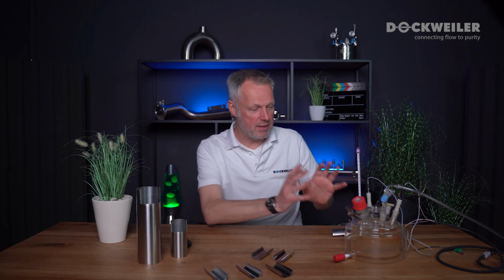In the last two videos, we have been talking about these samples, these specimens, where we identified carburization. And it was a more qualitative point of view. In this case, we would like to talk about the magic of analytics and what we do to quantify that.